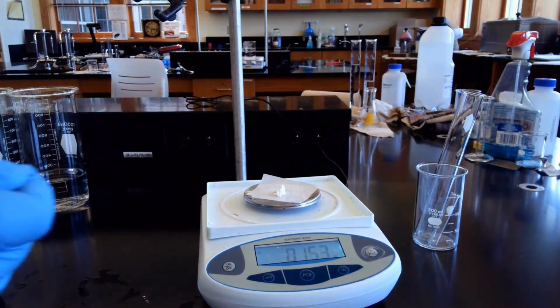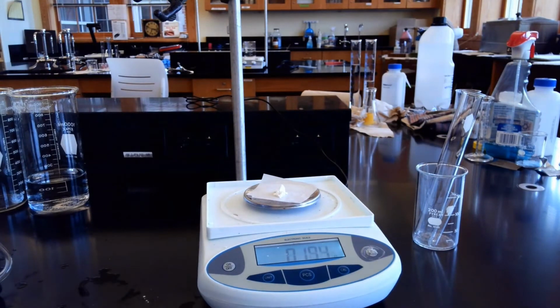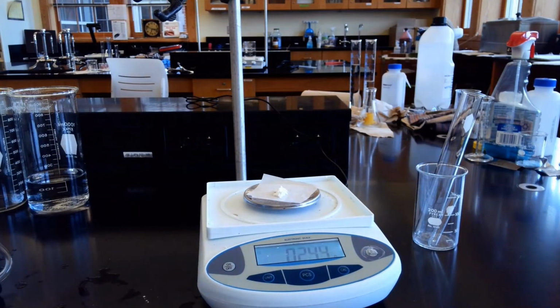that's 0.153 or 0.194. Keep adding. Here we go. We are at 0.244 grams. 0.244 grams. So now we're going to do the same thing we did before.